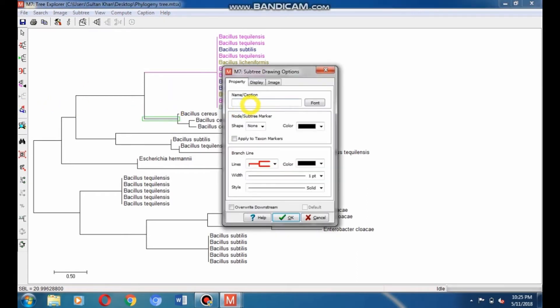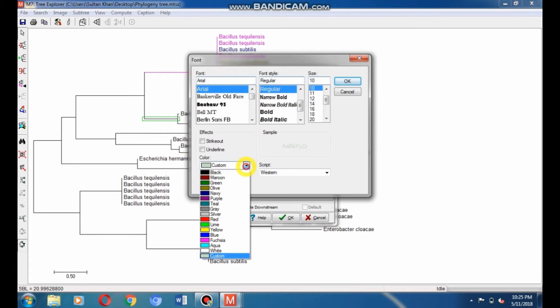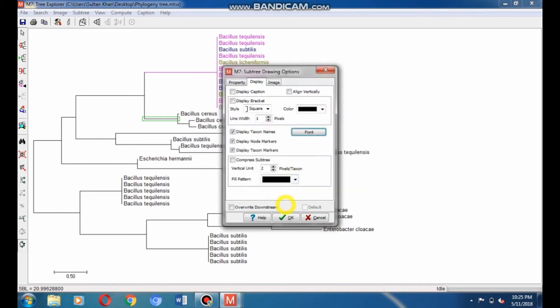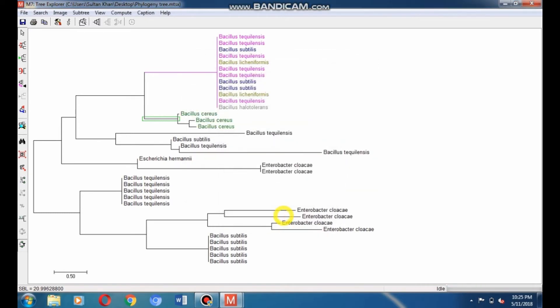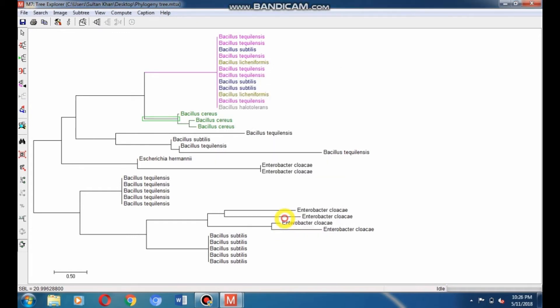Now give color to the Bacillus cereus clade. Put the cursor in front of it, select it, and go to subtree drawing option. Click on Display option, go to Font option, and select green color. Click OK to apply green color to all the taxa of the cereus clade. You can see all the taxa of the cereus clade now have green color. Select the cereus branch and go to subtree drawing option to give it green color.